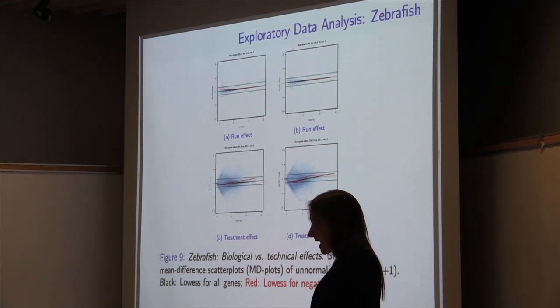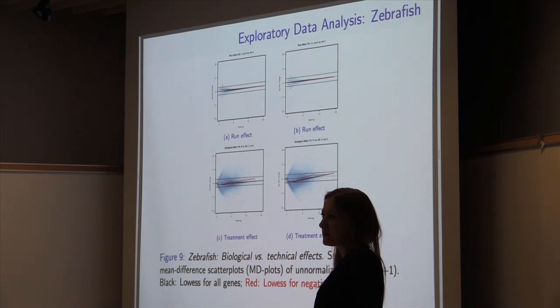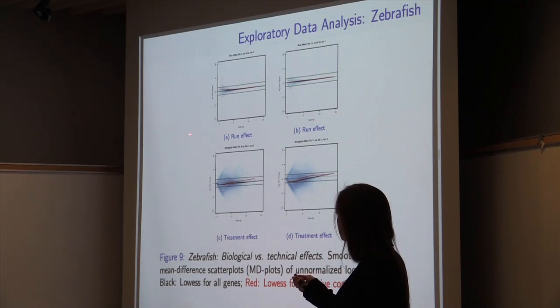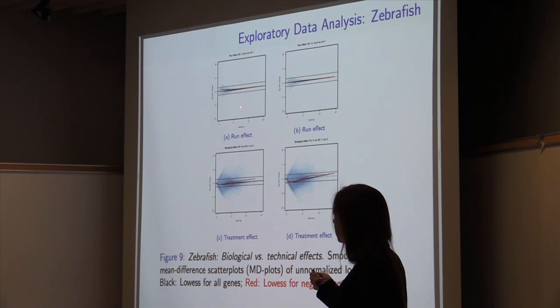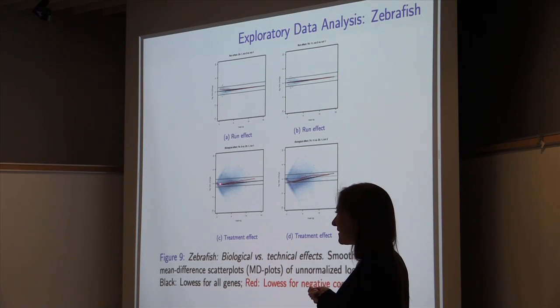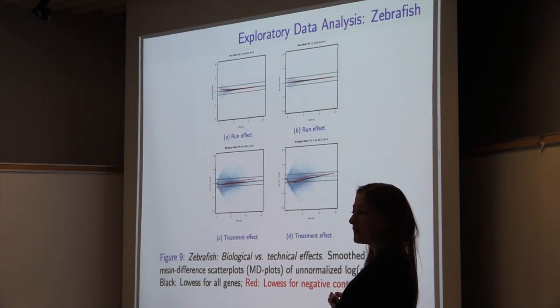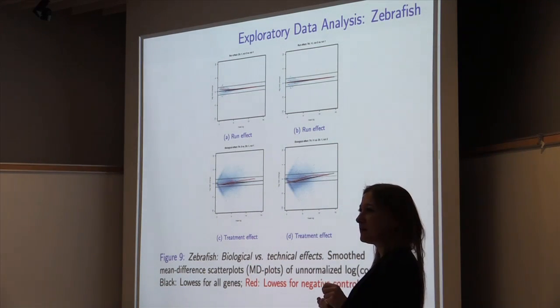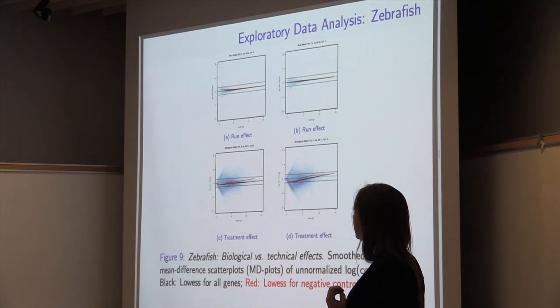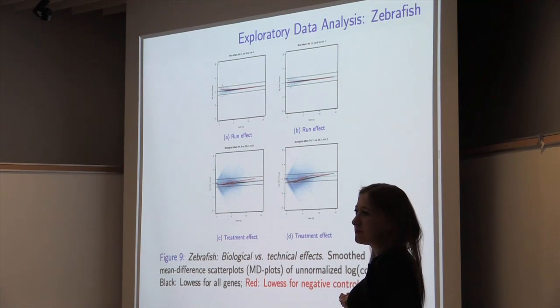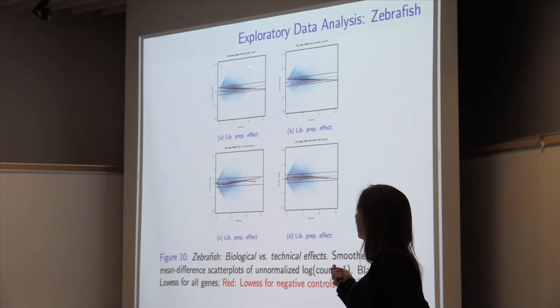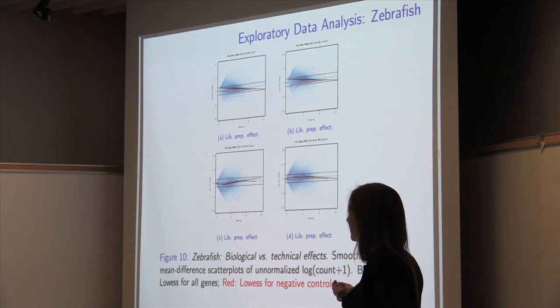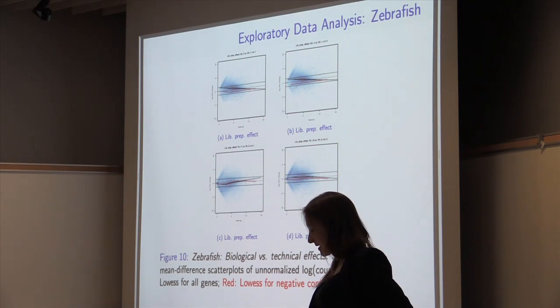Comparing biological and technical effects using MA plots — mean-difference plots of log fold changes versus average log expression. When comparing two samples from the same library in different runs, we see very little run effect. When comparing control and treated libraries, we see large treatment effects. But when comparing different libraries, we have strong library preparation effects of about the same magnitude as the treatment effect. The two sequencing runs show extremely high reproducibility, so we'll pool reads from both runs, leaving three treated and three control fish. Library preparation effects are of the same magnitude as the treatment effects.